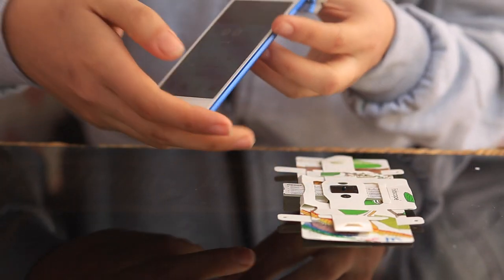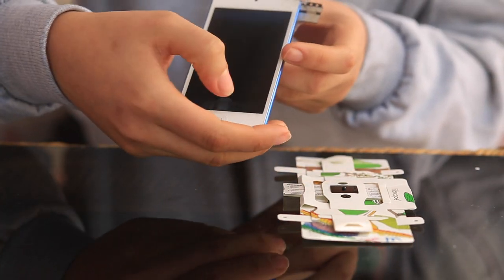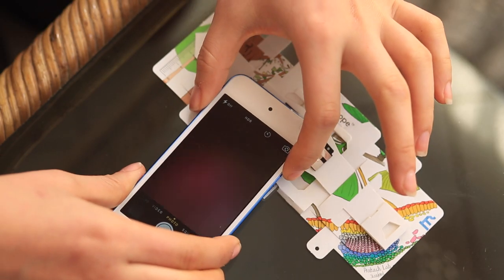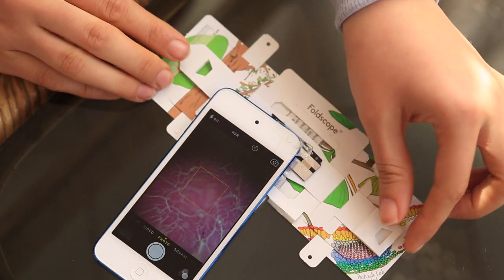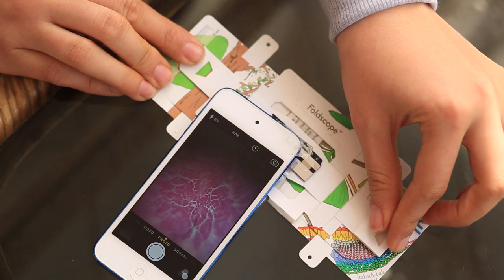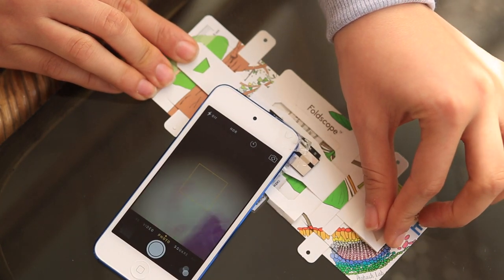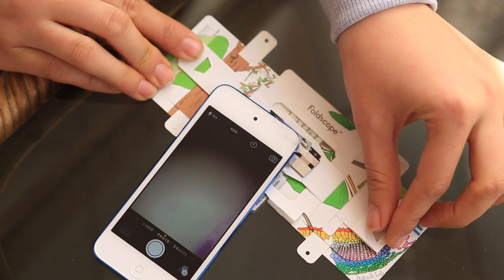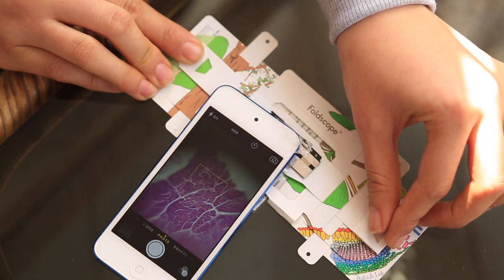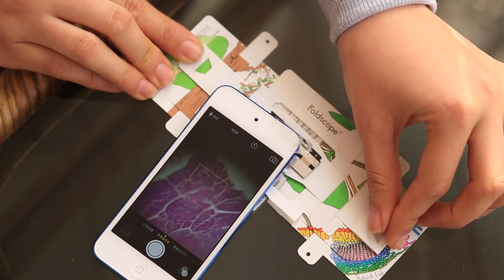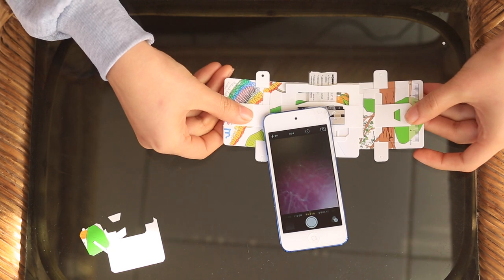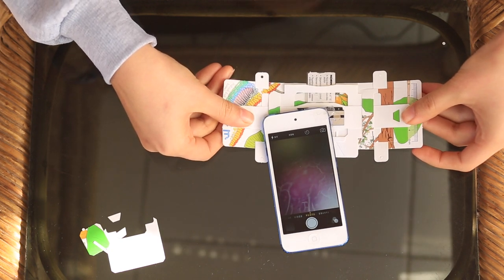You go to the camera mode. You're able to see the camera and you're like that. Then if it lines up correctly, you're able to see some pancreas. Then you're able to pan over it and look at different parts of the pancreas.